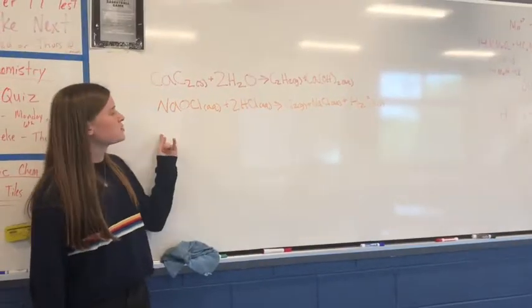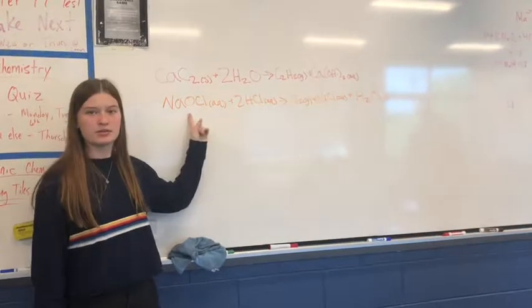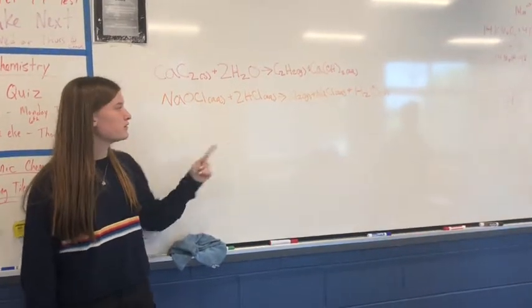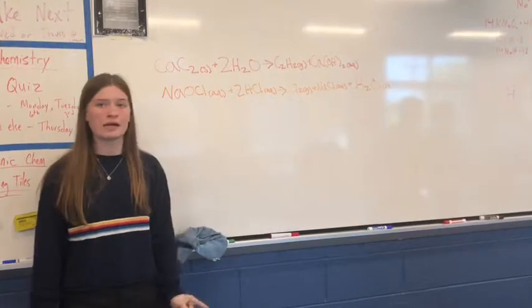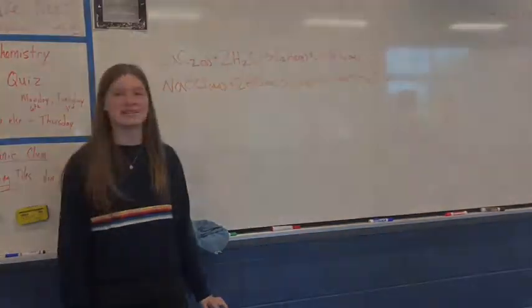This next reaction is the production of the chlorine gas. We place the hydrochloric acid into the bleach, and it reacts to form the chlorine gas. The chlorine gas travels through the tubes into the graduated cylinder.